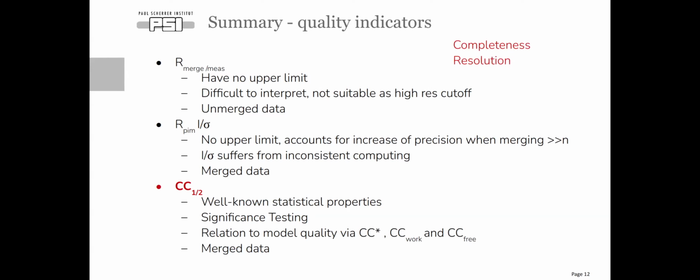Just a quick reminder, as Graeme also said before, obviously you're also interested in your resolution and your completeness. So if you compare data sets with these quantities, you have to make sure that you check what your completeness is and that you compare them with the same resolution bins.